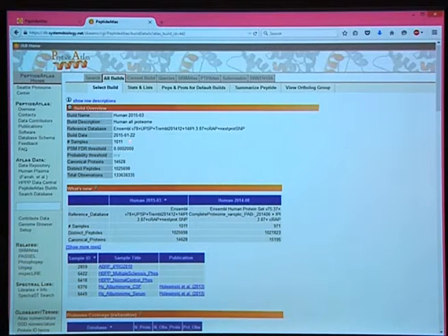We make a composite database when we search in order to be as complete as possible. We know from the past which proteins we've seen. And so we take essentially the UniProt Swiss-Prot portion plus TrEMBL, which basically makes the UniProt complete proteome. They have different definitions of what the proteome is.